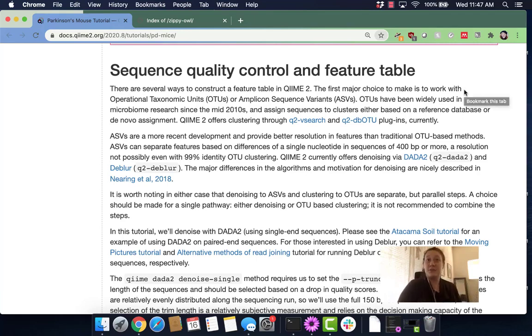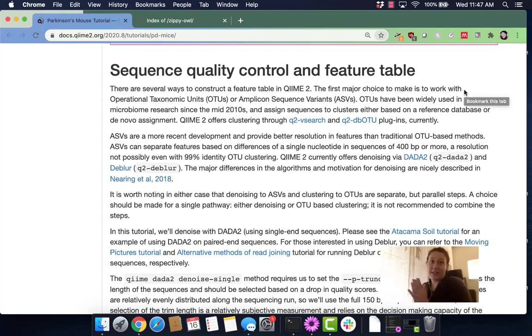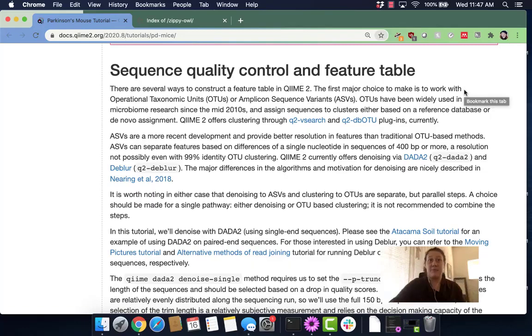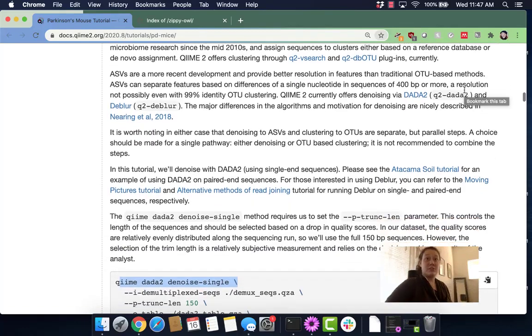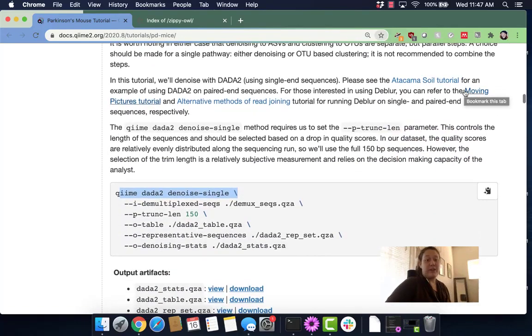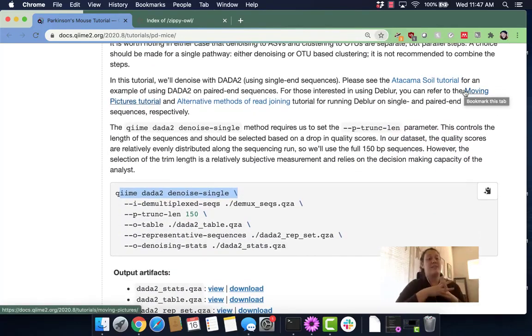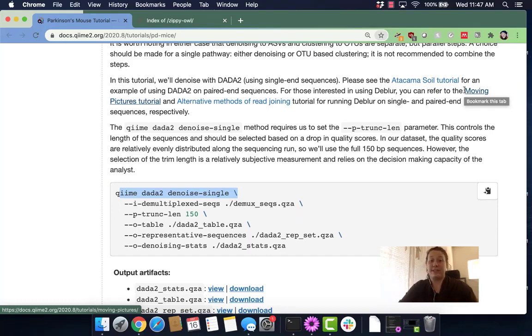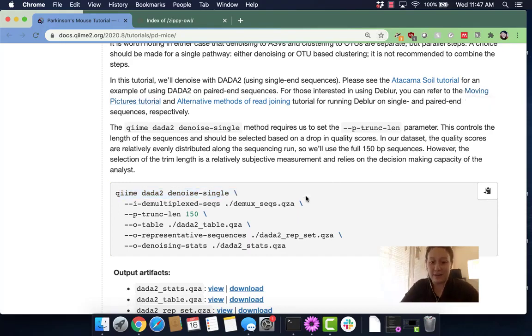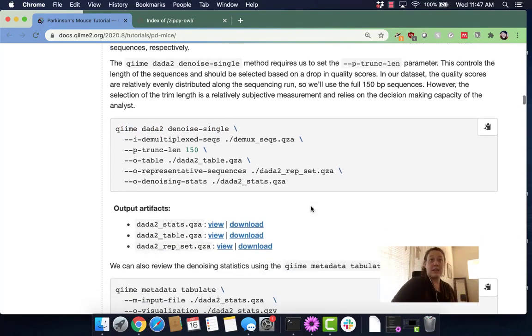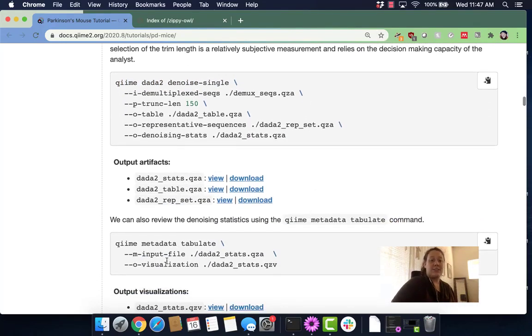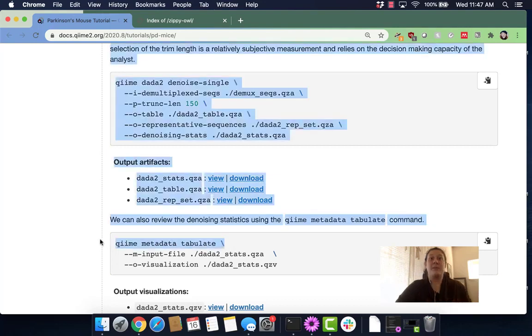Hi all, in this section of the tutorial we are going to perform some sequence quality control and denoise our data. First we will run QIIME DADA2 Denoise and then we will run QIIME Metadata Tabulate.